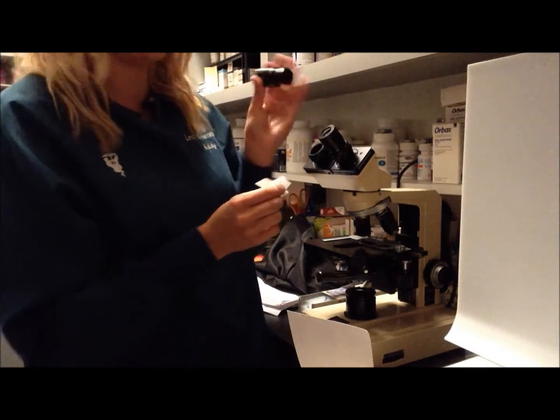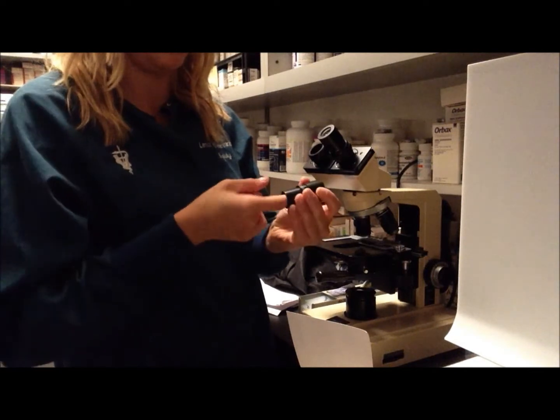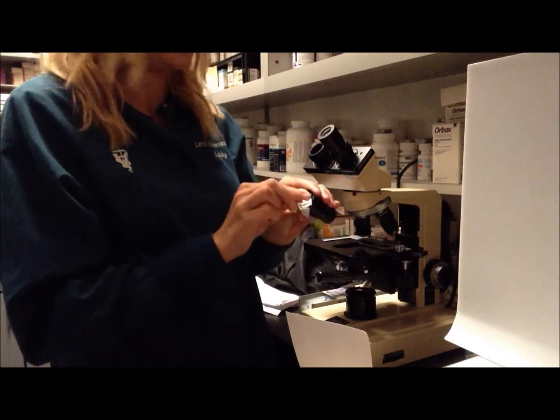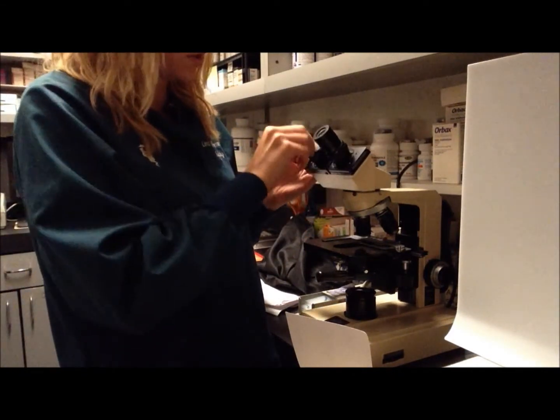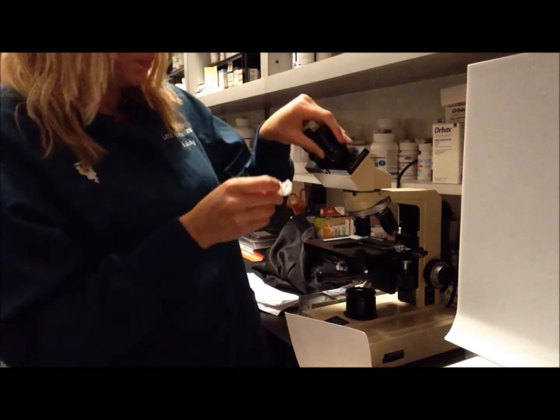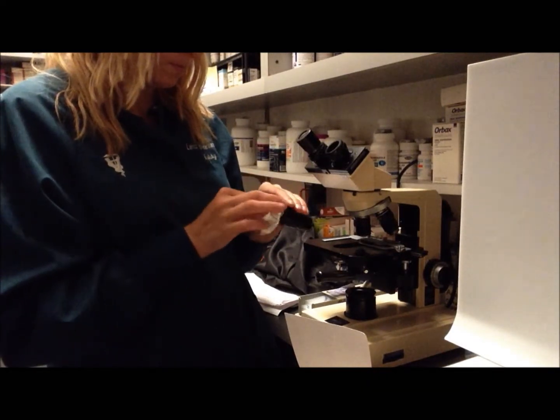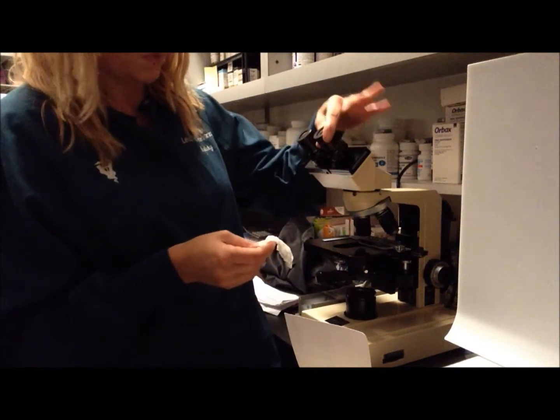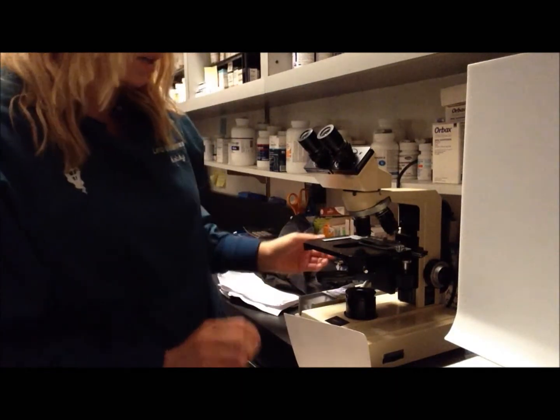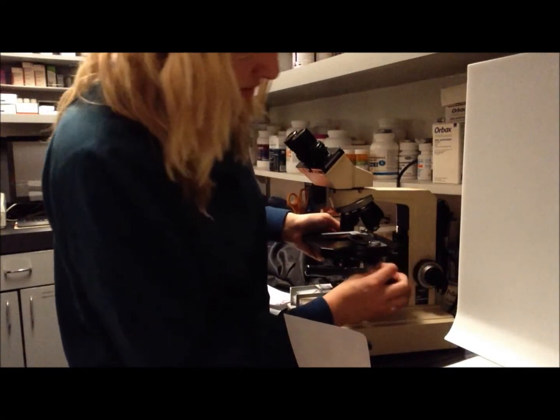And then you can actually remove the eyepieces. You want to make sure that you're very careful with them. And you can also do the same thing on the inside of the eyepiece and the outside. And then you can also clean the rim over here as well. And you can clean the stage with a little bit of alcohol. Then we have our controls over here. And you can just wipe everything down and dust it properly.